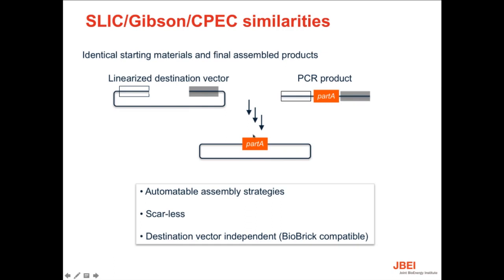So you get exactly the DNA out that you design. Unlike traditional cloning, where you still have the multiple cloning sites and the scars from doing the ligations, or BioBricks, where you have all these scar sequences, with the flanking homology methods you have control over every single base pair. And I think that's a really key value add of these methods.